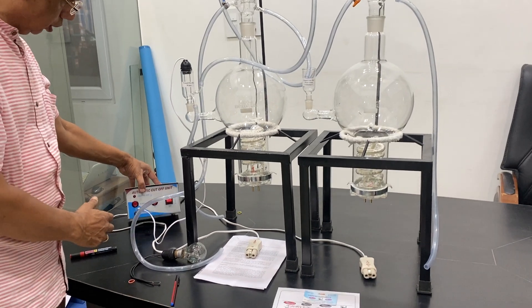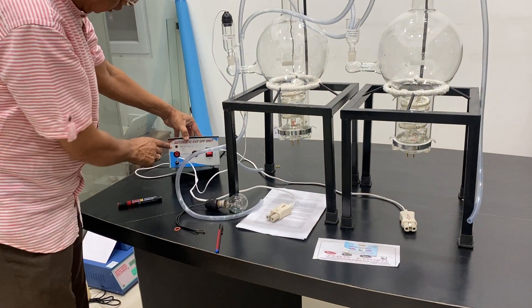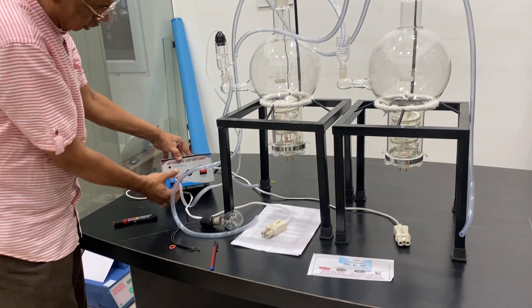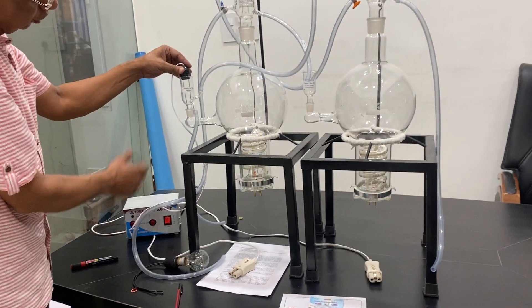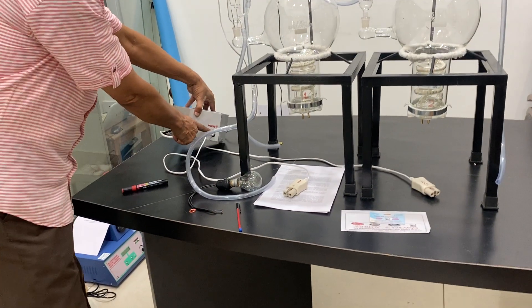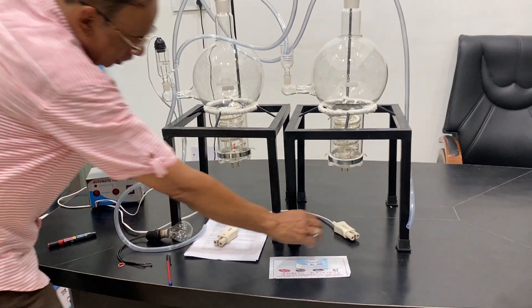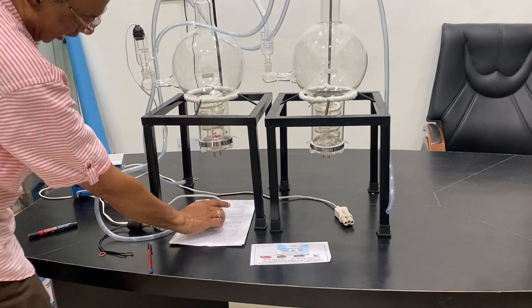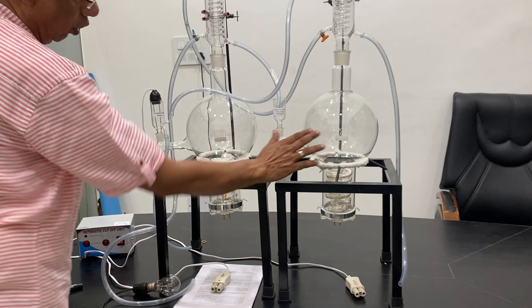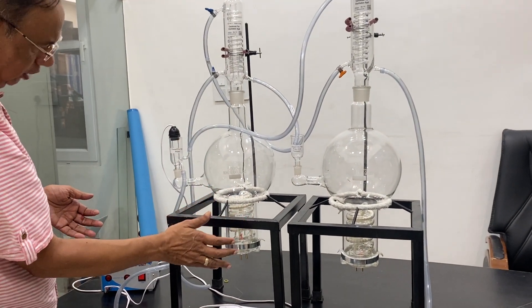Now I show you the working. You can see the automatic cutoff system. We have got heater one and there is one heater, and this probe is connected to the first unit. Then there are two — second probe also, second heater is also provided. This one is second, this one is first. Second is here and I am not connecting anyone since it is not having water. There is another video by Agnon which has water and distillation going on.